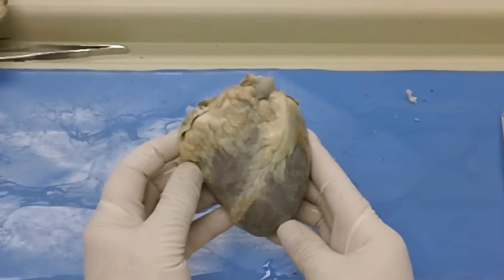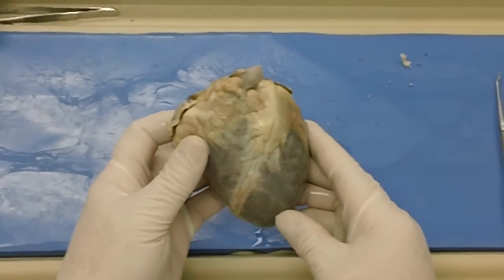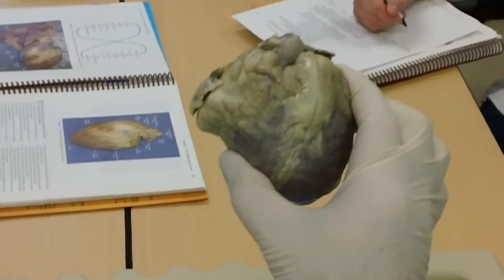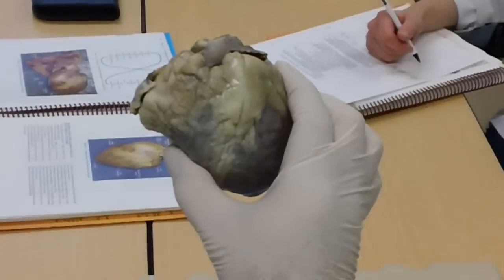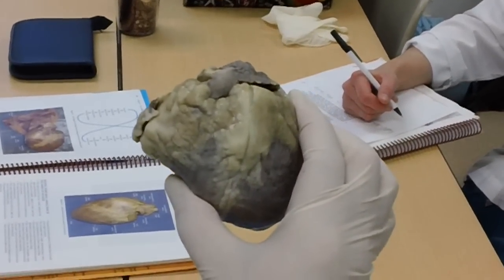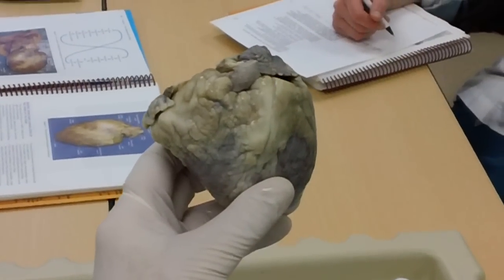If I'm looking at this heart right now, I have to figure out where things are supposed to be. If I held the heart just like this, where would the head of the animal be? Right here? Up where the camera is? If I was a human, that would be right. Over here? Over there? Here? Or here?